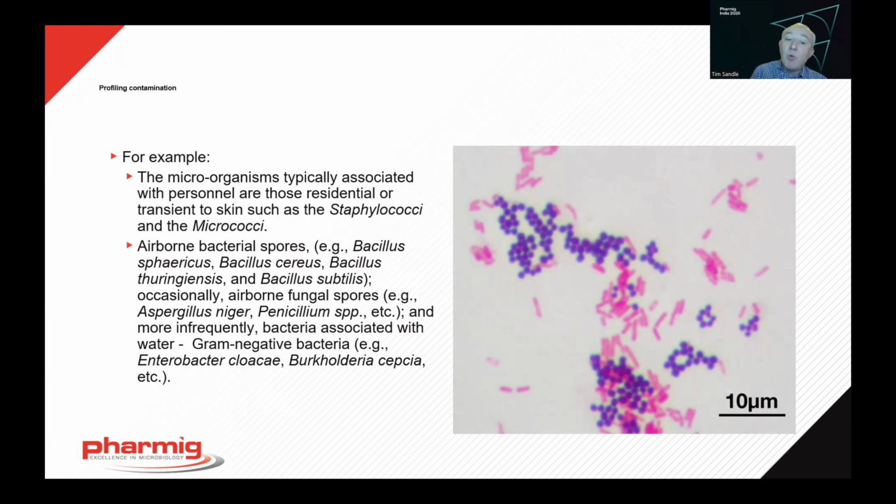And then we have the spore formers and the importance of trending those. And then if we find gram negatives, well, that gives us a conundrum. The gram negatives we can approximately divide into two groups based on whether they are fermenters or non-fermenters. There are certain gram negatives that we would classify as enteric, so they will be coming from within the human body.